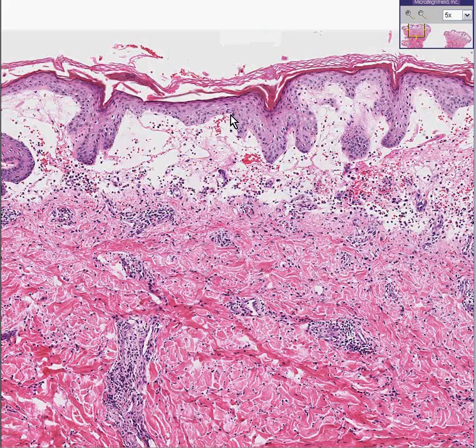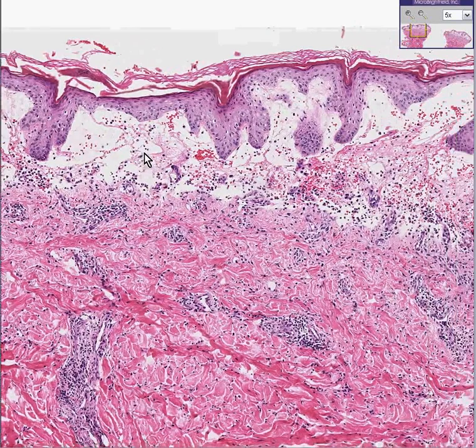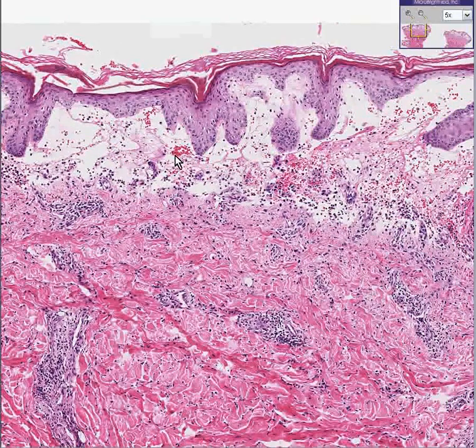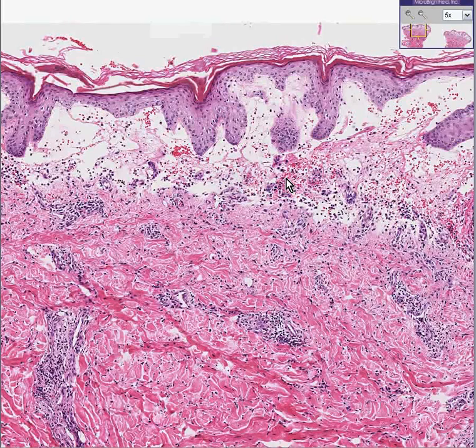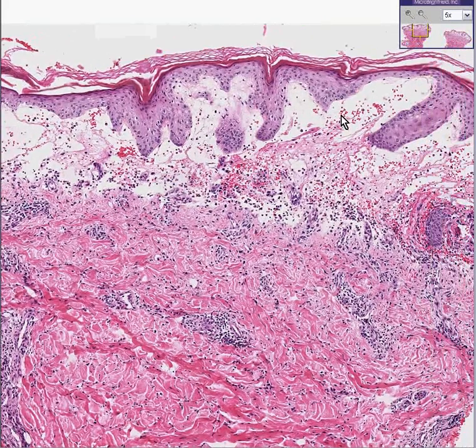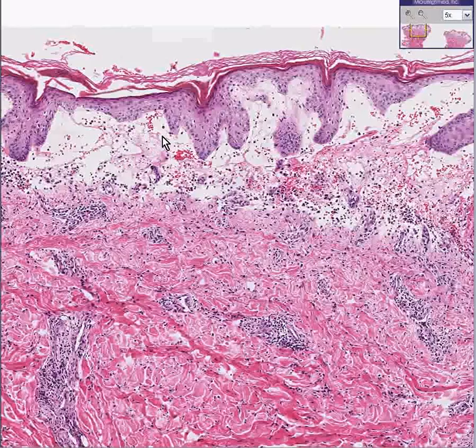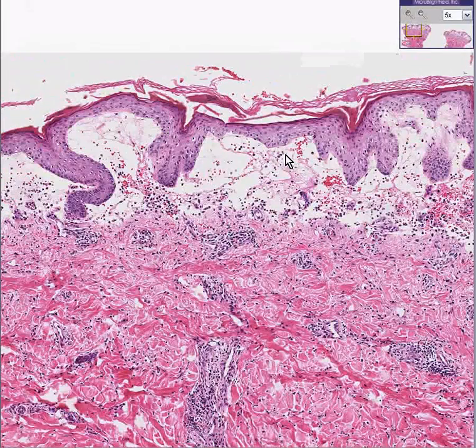Notice we have an intact epidermis. We have a stratum corneum. We have a reticular dermis. Notice how the proximal or papillary dermis, however, is very, very loose and edematous, and has a lot of blood vessels. So that's why it might look erythematous, because you have a lot of these blood vessels dilated near the surface of the epidermis. And this is one of the many classical histologic appearances of erythema multiforme.